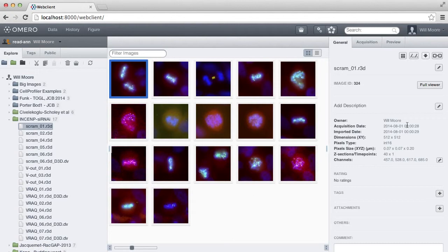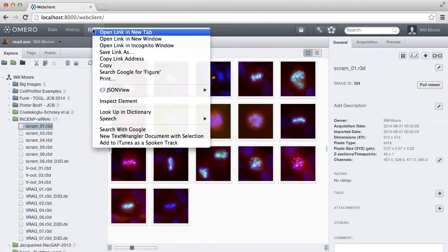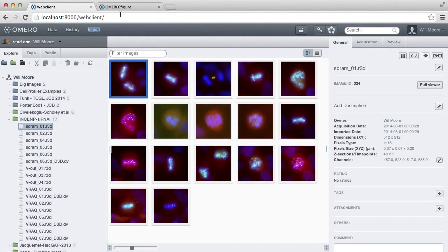If you're starting in the web client page like this, and OMERO Figure has been installed by your sysadmin, you'll see a link to Figure up here, and what you'll usually want to do is to right-click on this and open it in a new tab.